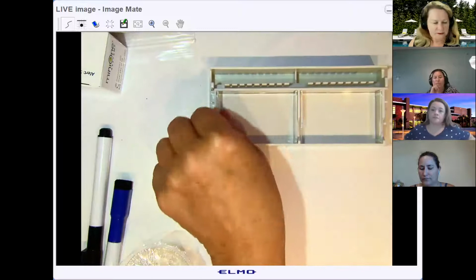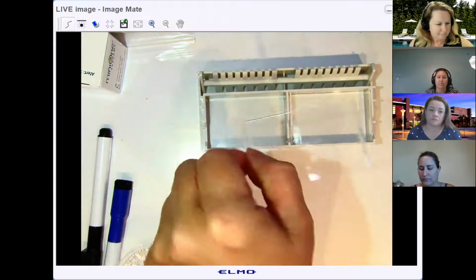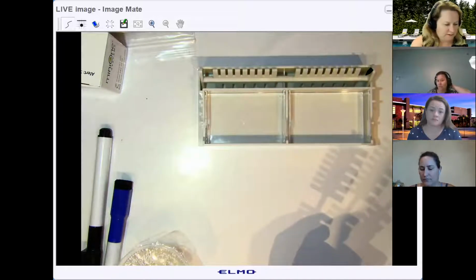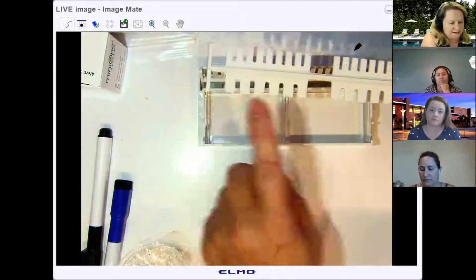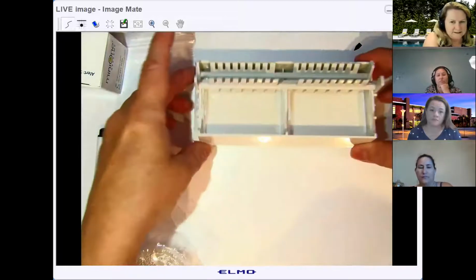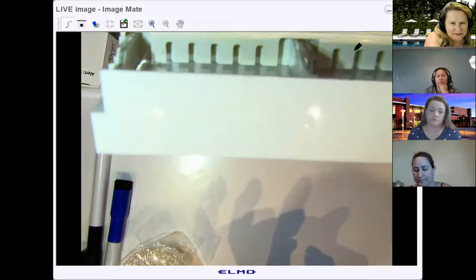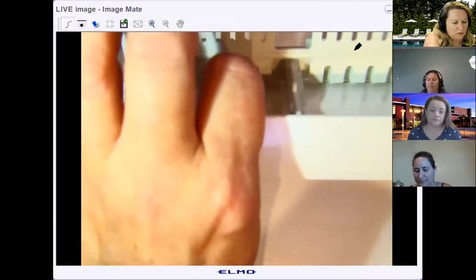All right. So here's how you pour the gel. In the MiniOne system, it comes with this little tray. It's got an insert here. With this tray, you can pour 2 separate gels at once. We're just going to do 1. And then you have this, which is called the comb, and the comb has teeth on it. This fits in up here. I don't know if you guys can see it or not, but the comb does not touch all the way to the bottom. There's a little bit of space. I think you guys can probably see that. There's a little bit of space between the bottom of the comb and where you pour the gel.